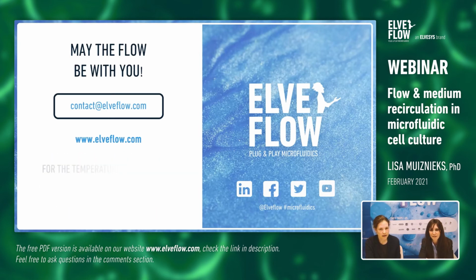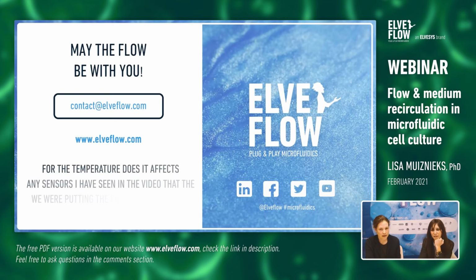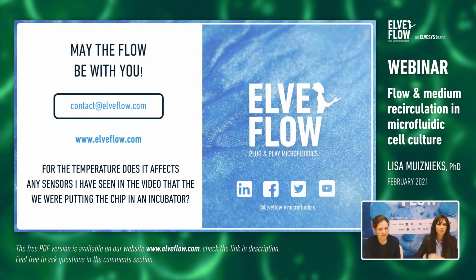From Abbas: for the temperature, does it affect any sensors? I have seen in the video that we were putting the chip in an incubator. As general information, we put only the chip in the incubator.